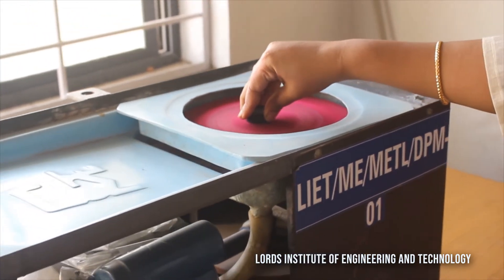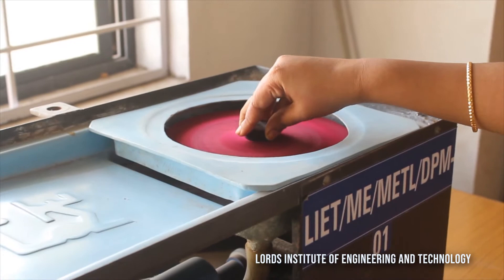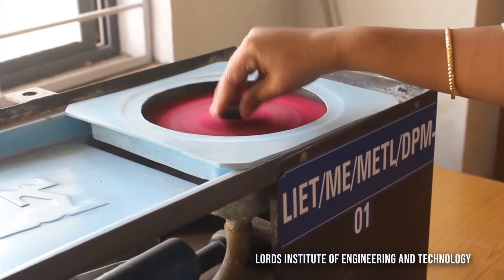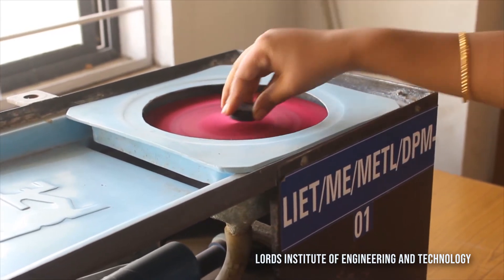If you feel uncomfortable holding the piece against the disc at this speed, you can gently remove it and place it again, because holding it for too long will affect the result. We have now completed the grinding and polishing operations.